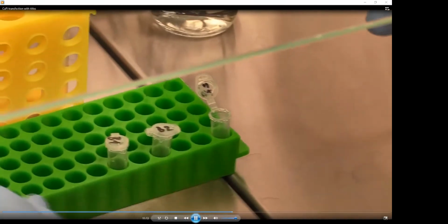And then next step, calcium chloride. Once again, dropwise, and mix it. So this way we have prepared all 3 B samples which contain water, DNA, and calcium chloride.